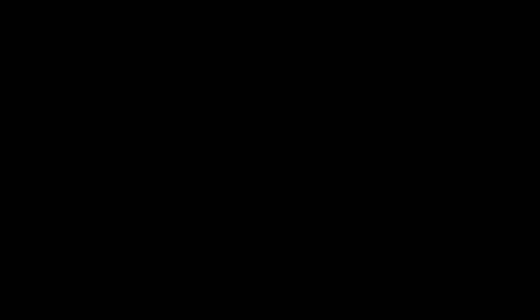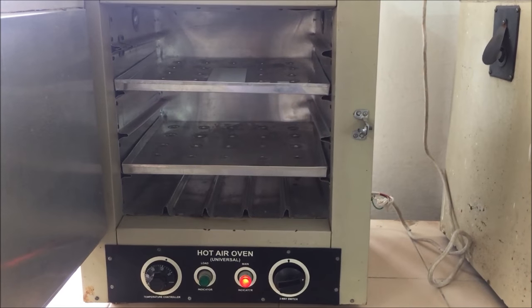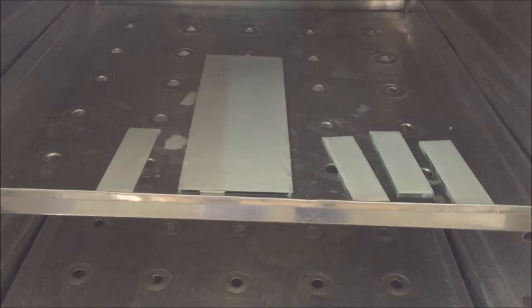After drying the plate at room temperature, then finally place the dried plate in a hot air oven for about 1 hour at 100 to 105 degrees Celsius to activate them.